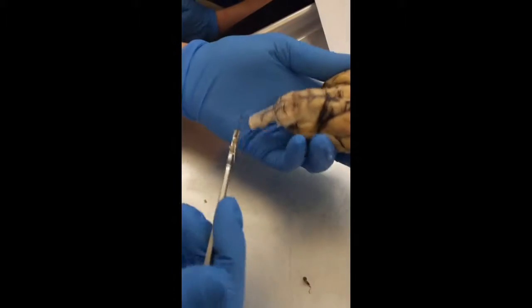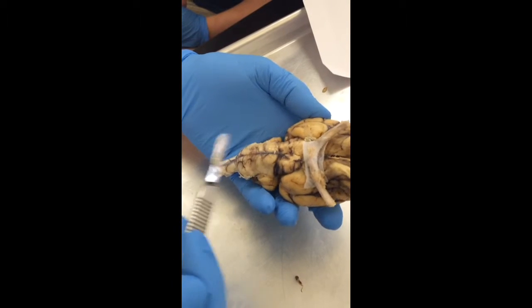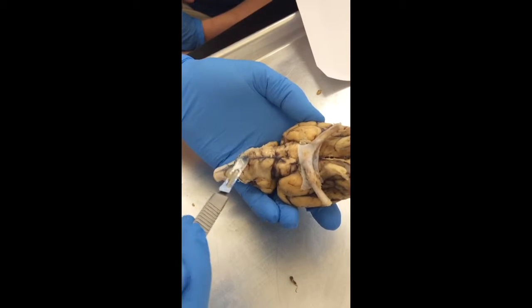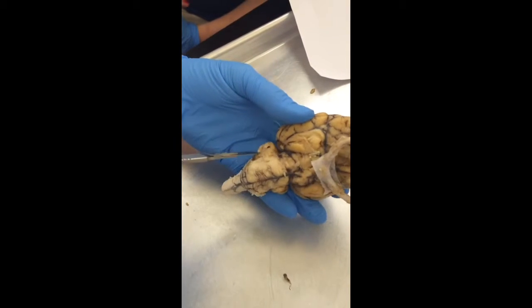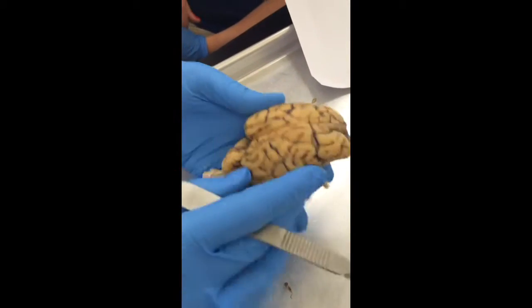Now, spinal cord. 1, 2, 3 areas. So this is the medulla, pons, midbrain. And I also know that's the pons because it connects to the cerebellum. Okay, come over here.